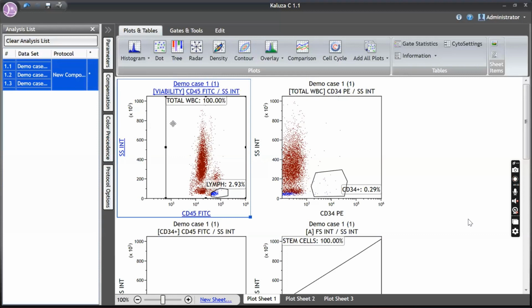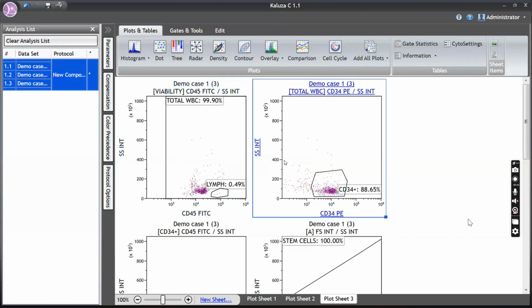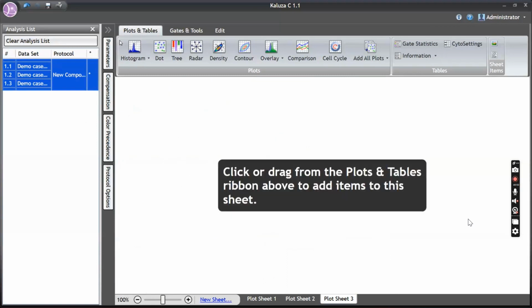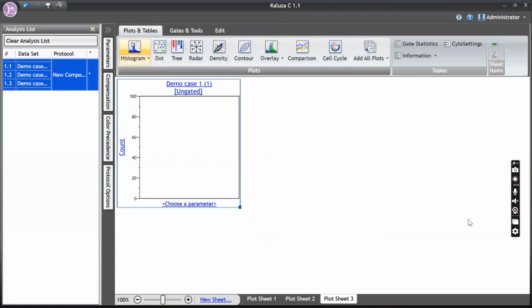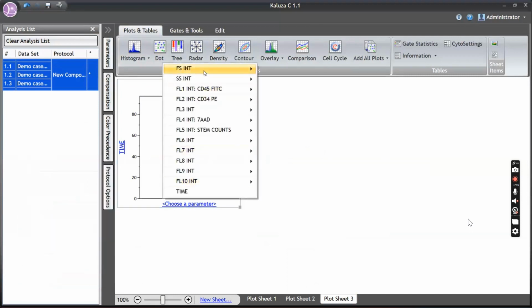I'm going to delete all the plots because this is unstained. So second will be stained, I suppose. Now you need to tell me how to do this. Okay. So first plot I'll draw. The first plot is the time plot. So you put time and forward scatter.